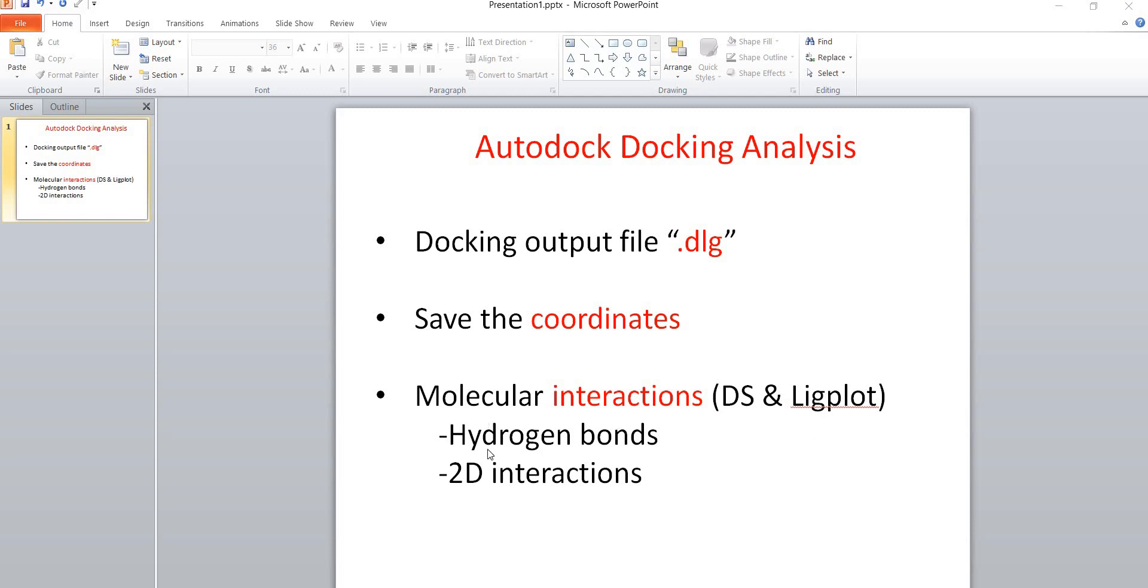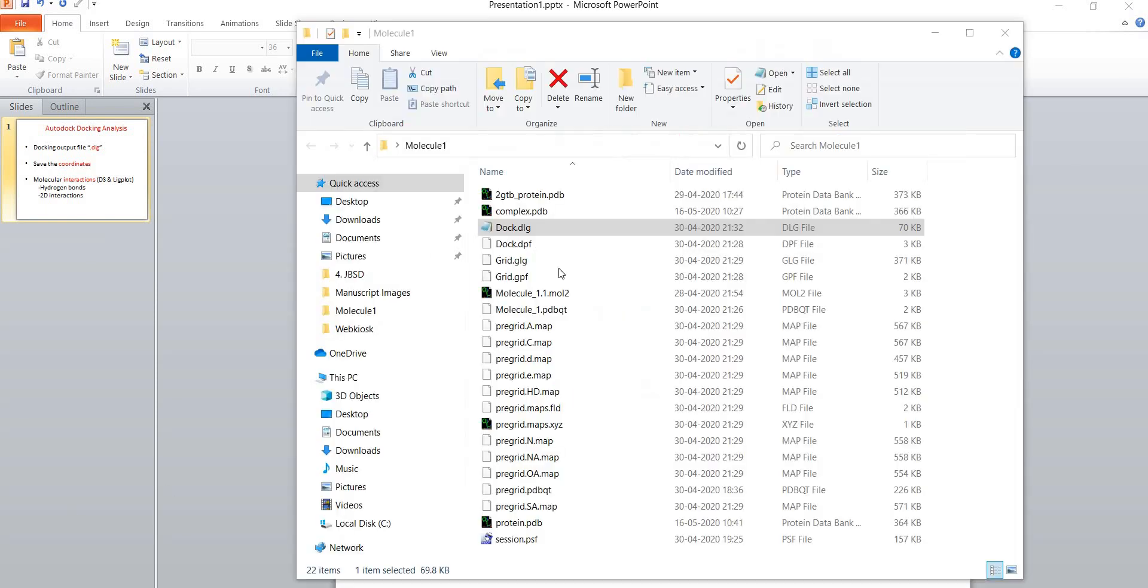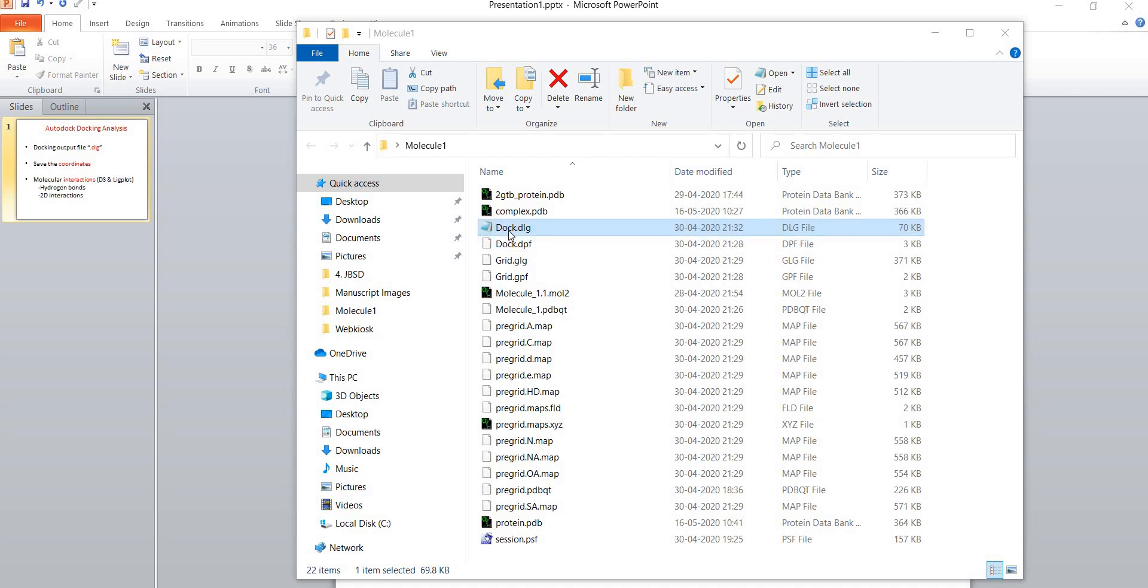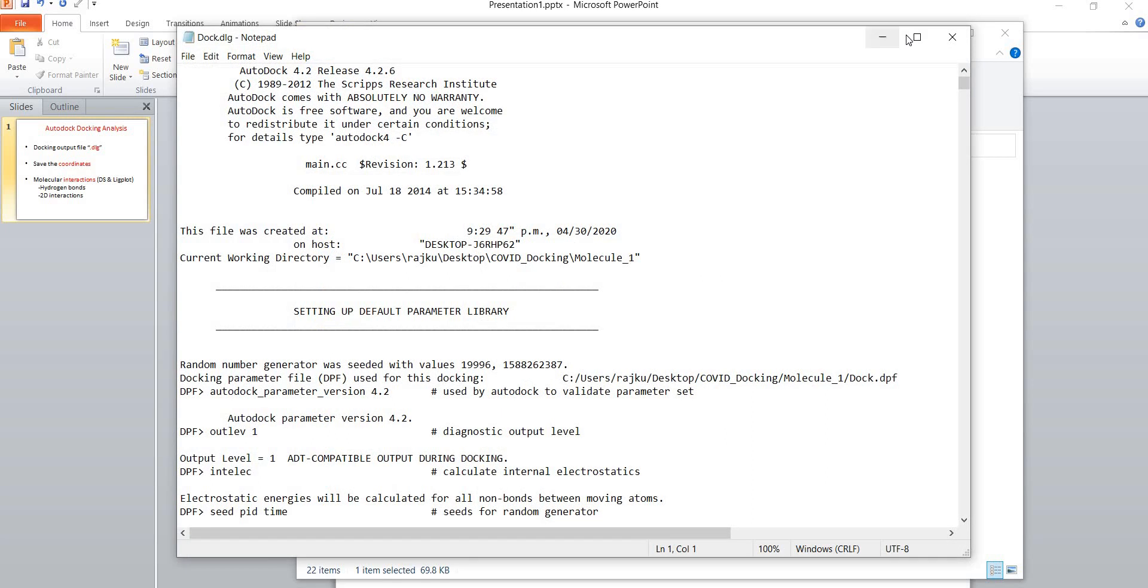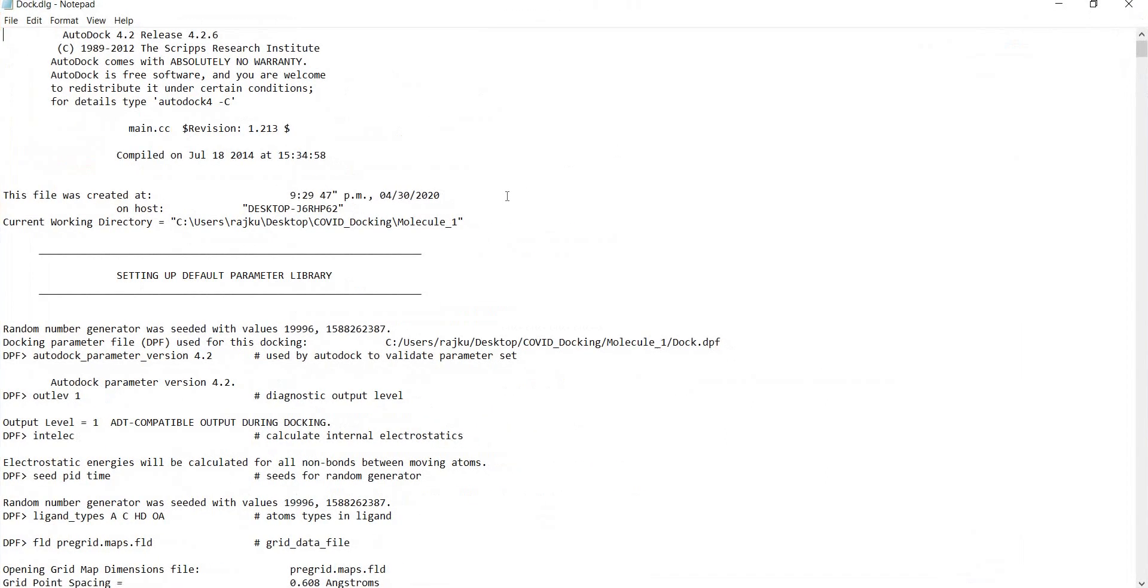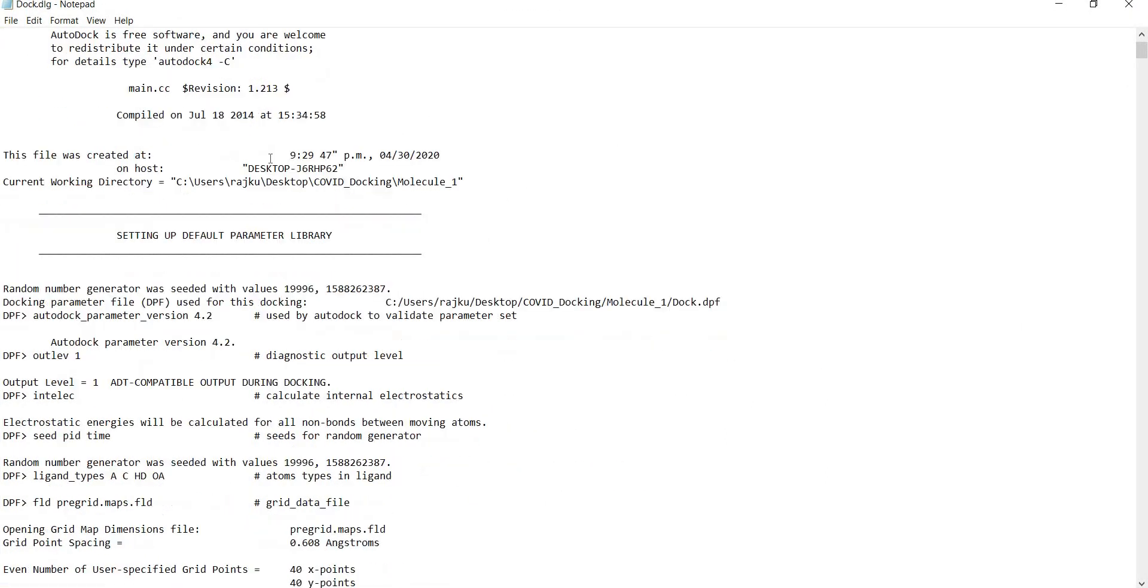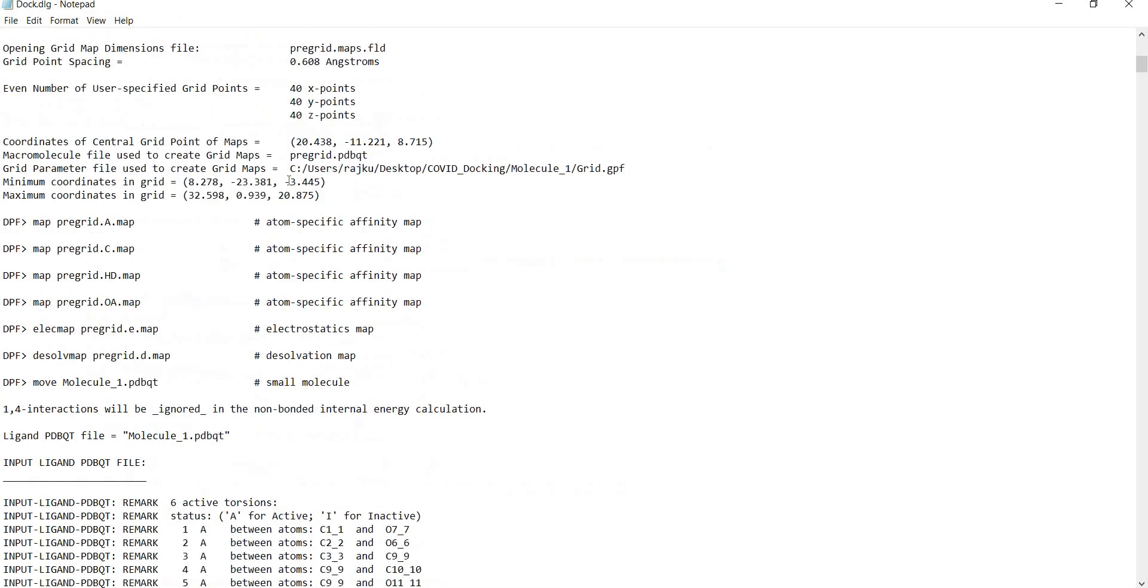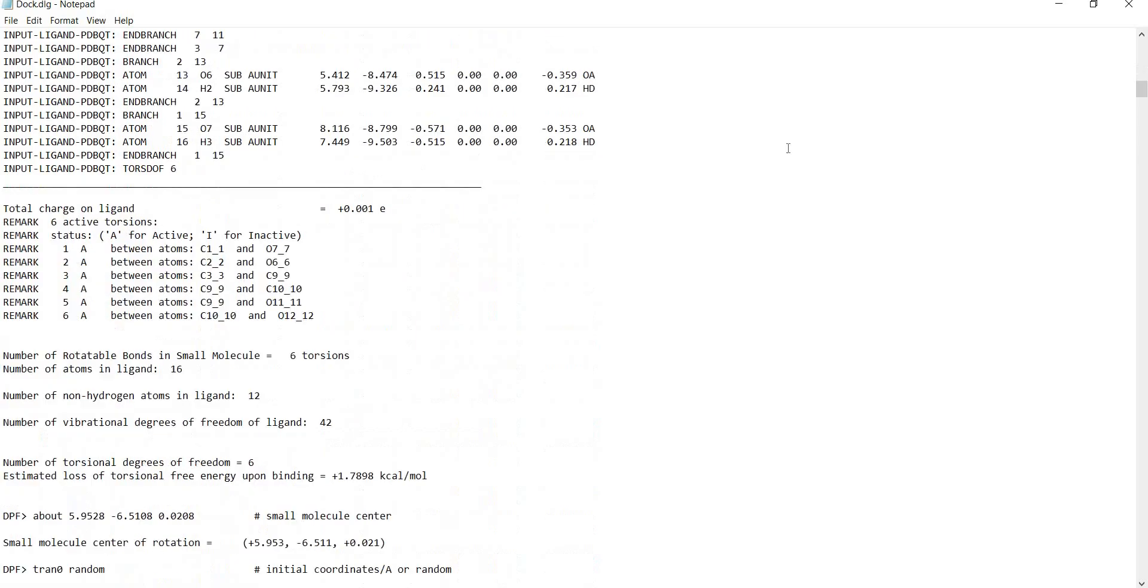This is the docking folder and in the output you will receive this file which is a .dlg file. I have named it dock.dlg. You can simply click and open this file and this is how it looks.